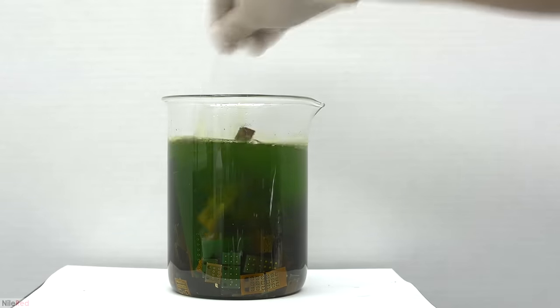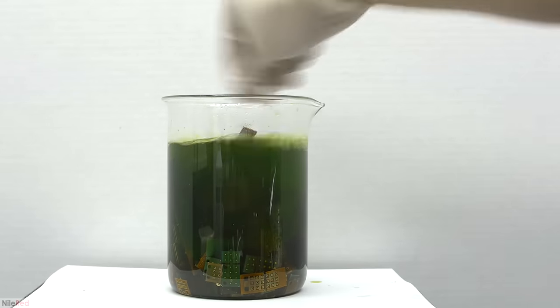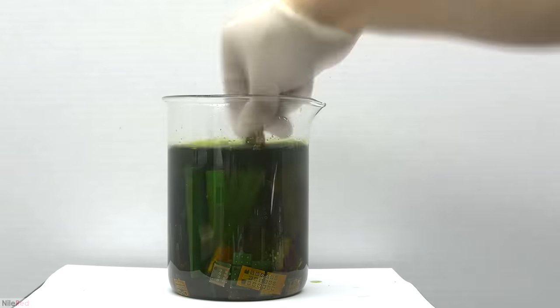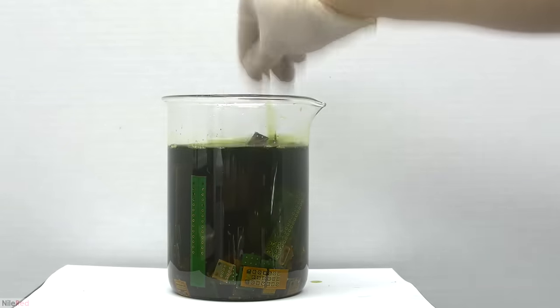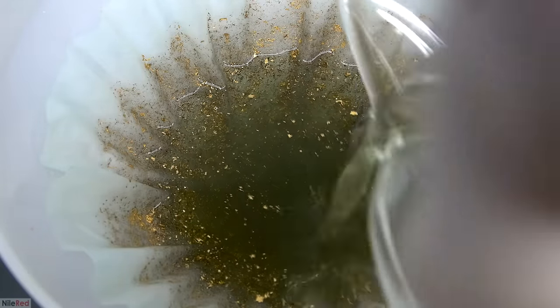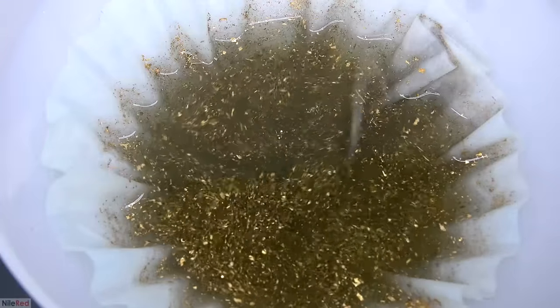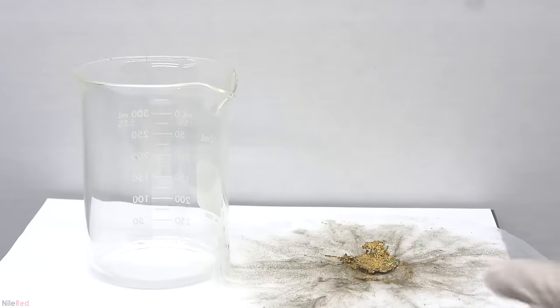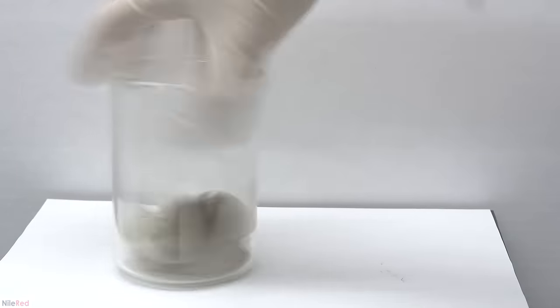In general, there are three major steps to recover gold from computer scrap. The first thing we need to do is separate the gold from the circuit boards by dissolving the metal that the gold is plated on. This step results in a mixture of gold flakes and a bunch of other debris, so the second step is to purify the gold. In this second step, we selectively dissolve the gold and leave behind pieces of circuit boards, plastic, etc.